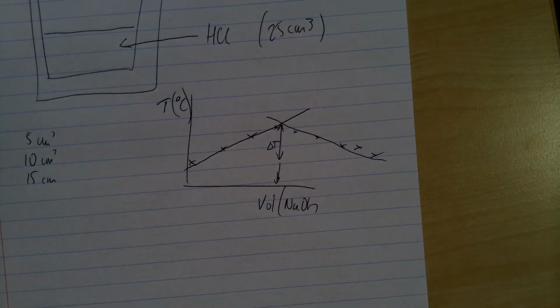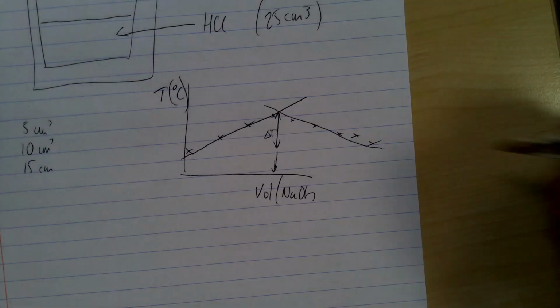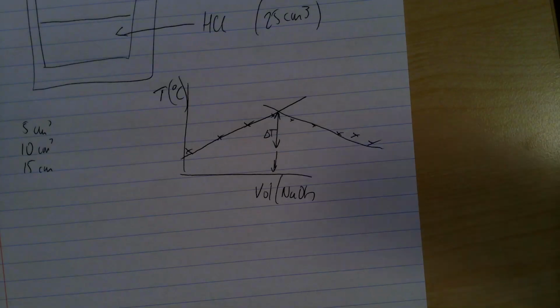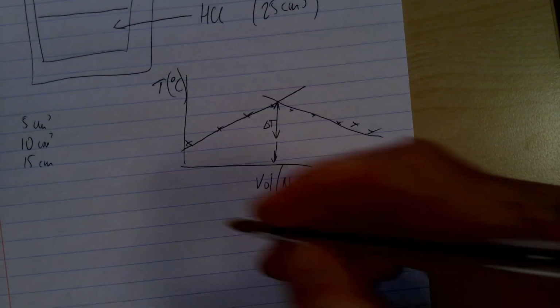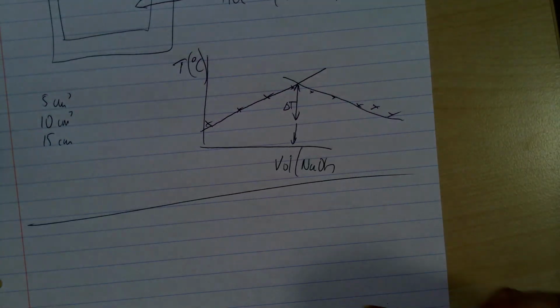So I thought it was worth spending a bit of time on that. And what's going on here is, as you've added more hydroxide than you need, you're just adding a cold liquid to a hot liquid, and of course that'll mean it'll cool down a little bit. So where are we?